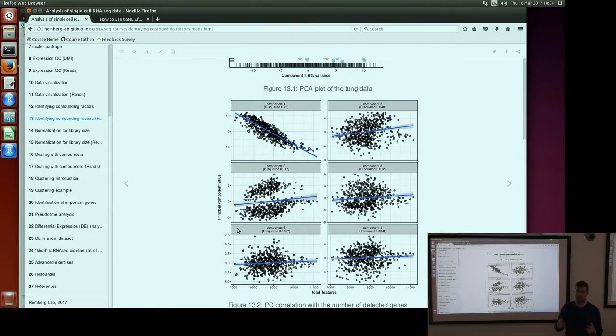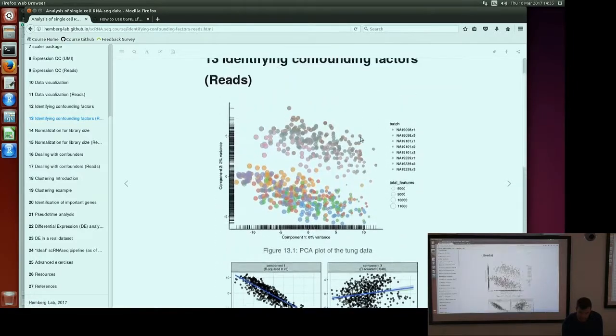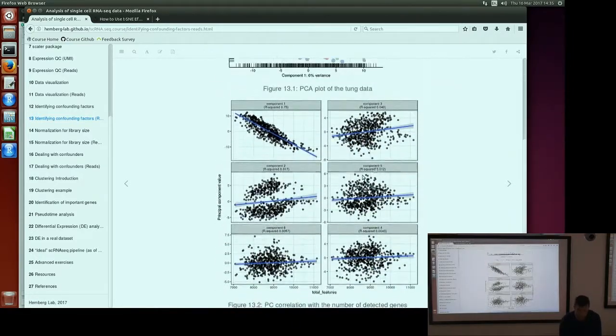So to make them at all comparable, we need to account for that. And so by default, the package does that if you provide it with a count matrix when you build the object. So these PCA plots, for example, and these QC plots, the expression values that we're thinking about in here are log2 counts per million with that small offset.